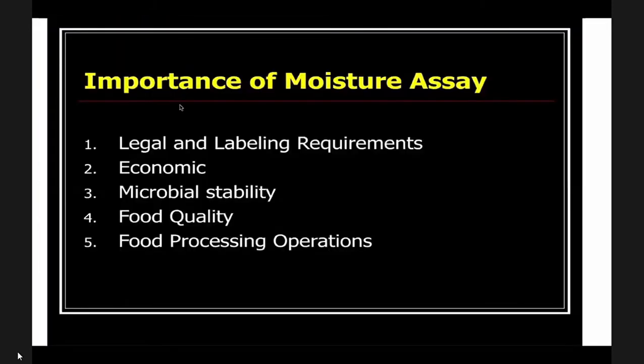Okay. So the importance of moisture is for legal and labeling requirements, specifically in food. It also determines the cost efficiency of a formulation, so it is economic, and also microbial stability. The higher the moisture, usually the faster the products spoil. Next, also food quality and food processing operations. So these are the importance of moisture.